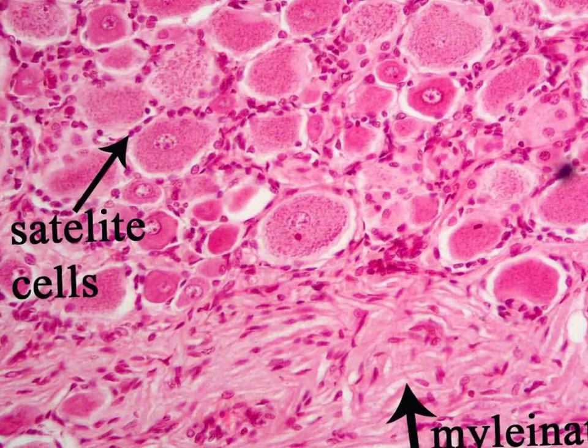We can magnify it more. These are the satellite cells, low cuboidal cells, neuroglial cells in the peripheral nervous system around the cells of the ganglia, and this is the nerve cell. Always there is a gap between the servant and the queen. We have this gap. And then we have this nucleus with achromatic appearance and the nucleolus, and this is the cytoplasmic granular appearance, as you see, representing the Nissl granules.